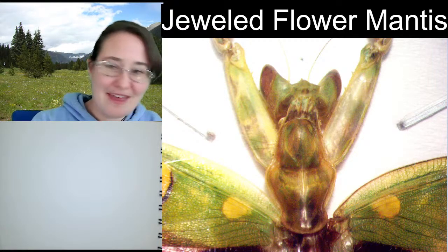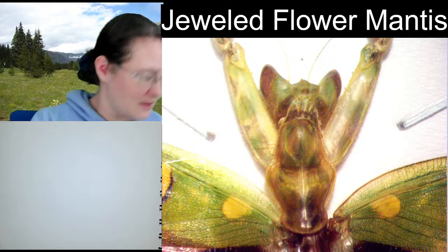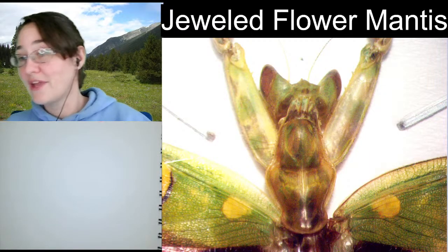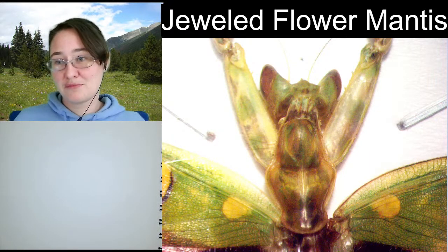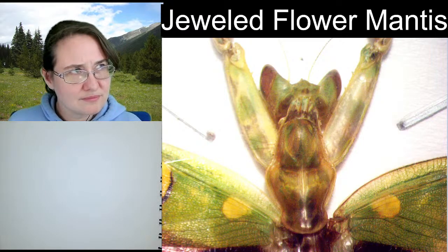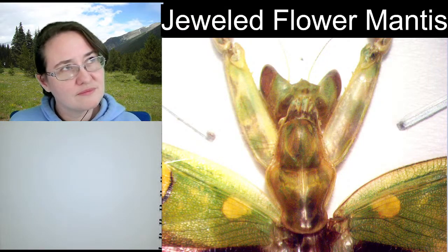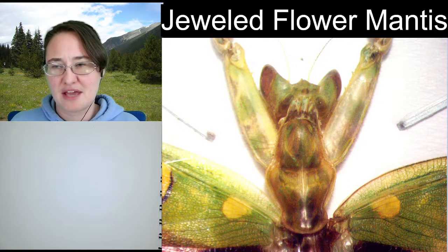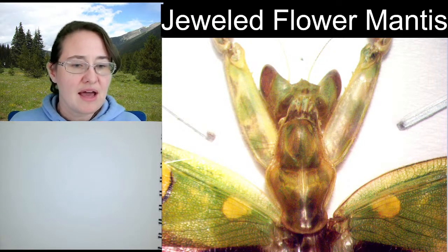Let me check. 1, 2, 3, 4, 5, 6, 7, 8, her. Female mantid. Yeah, the females have more abdominal segments, and the males have less abdominal segments.